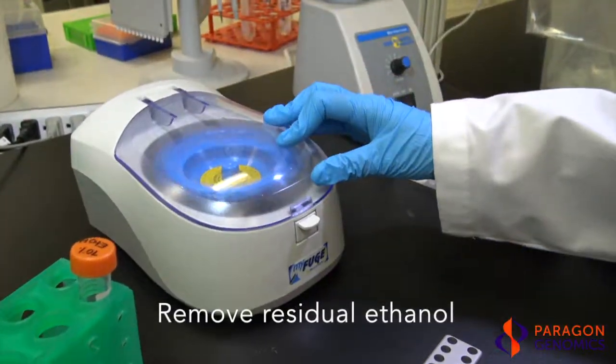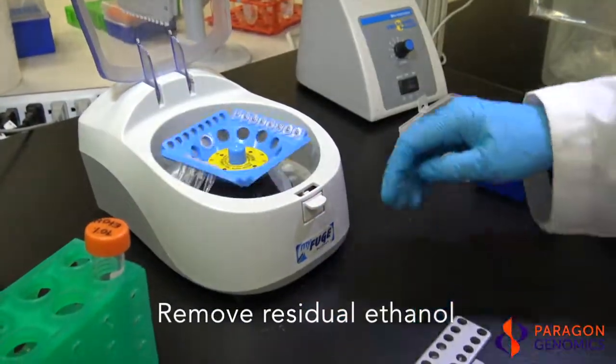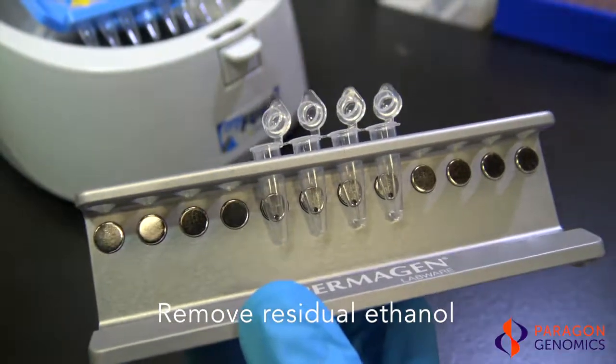After the second wash, briefly spin down the tubes to collect any residual ethanol and then place the tubes back onto the magnetic rack. Remove any remaining ethanol using a 10 µL pipette tip.